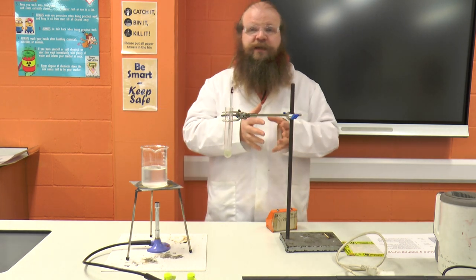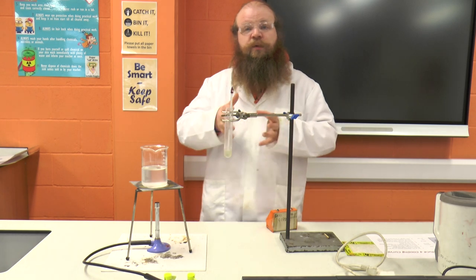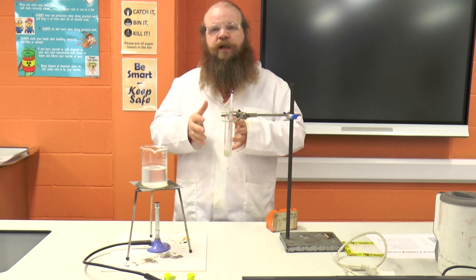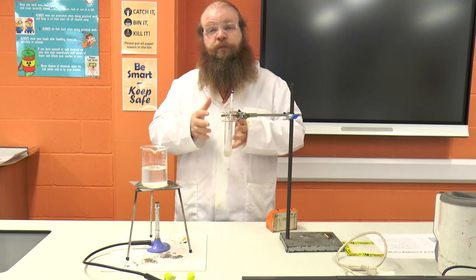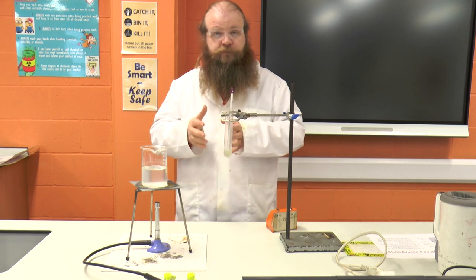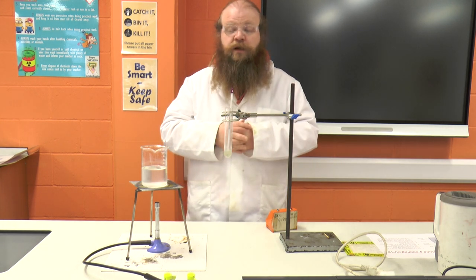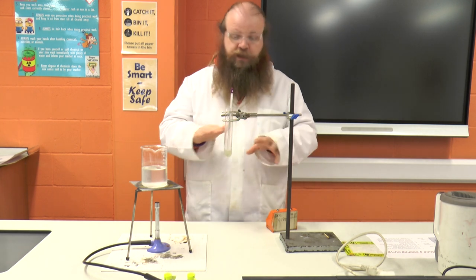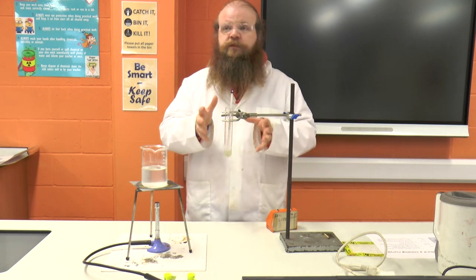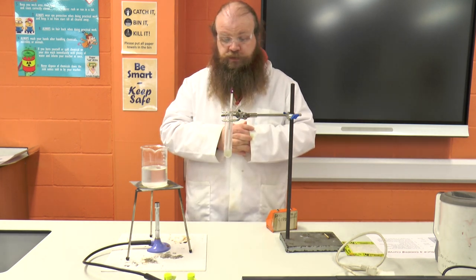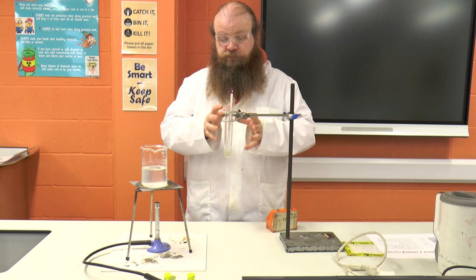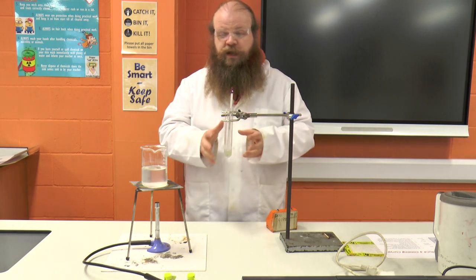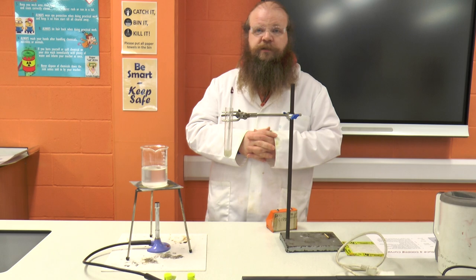You would get more accurate and slightly quicker results if you were using a digital thermometer or a thermocouple. We're just going to keep doing that every 30 seconds until the stearic acid is completely solidified and we've got down to 40 degrees C.